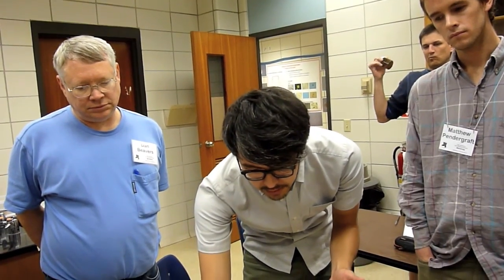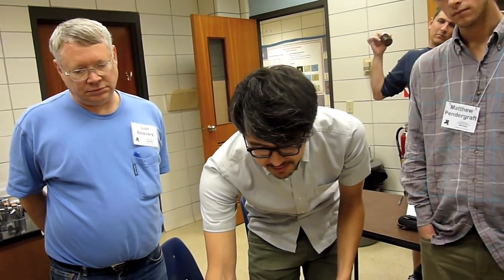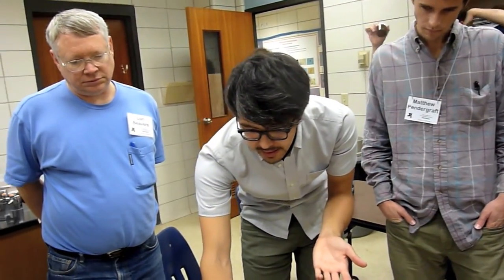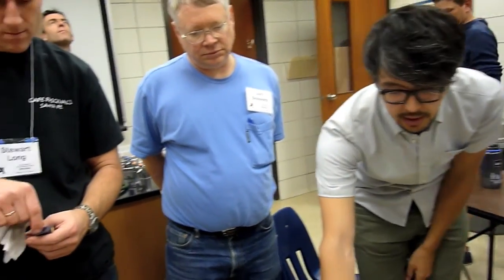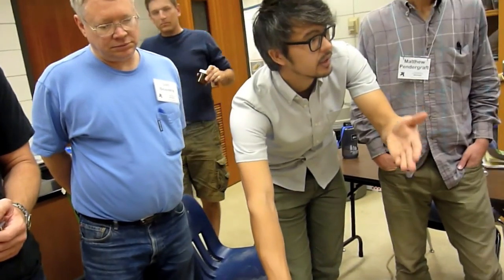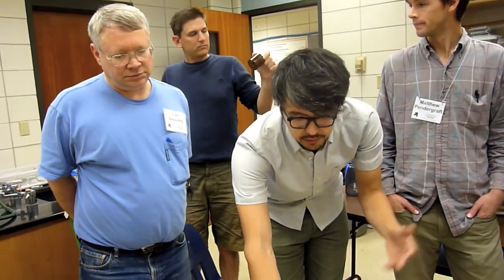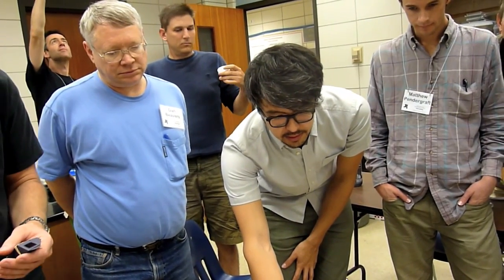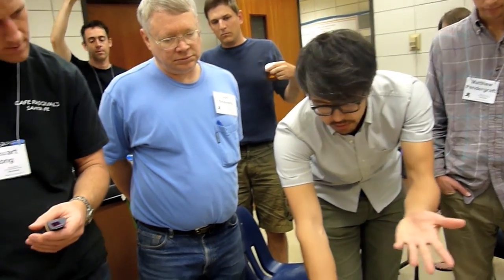And I apologize. We're going to try to improve the interface. It's pretty ugly right now. But you press this button, calibrate. And we can go through this a few times if you want. It's also the very first video on the front page of spectralworkbench.org. But it's good to see here. And then it says, click on the middle blue band. And I know this one here is it. And there's a learn more link.